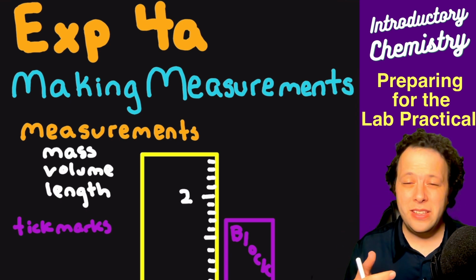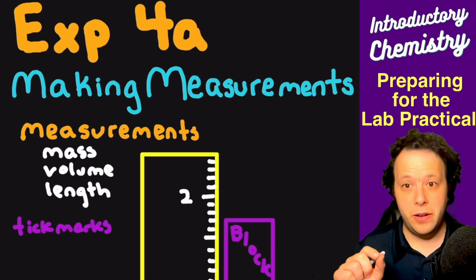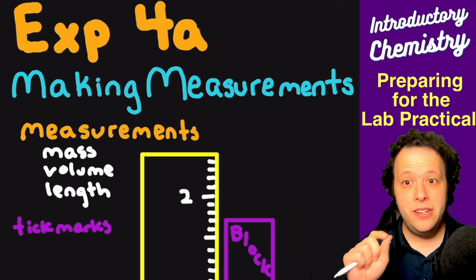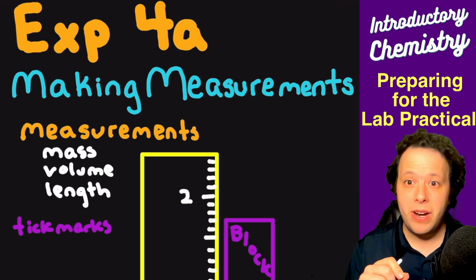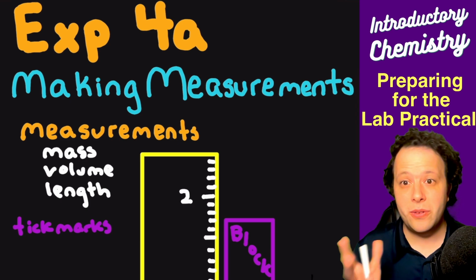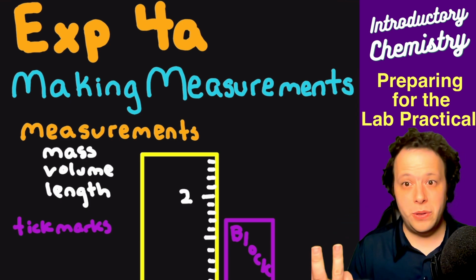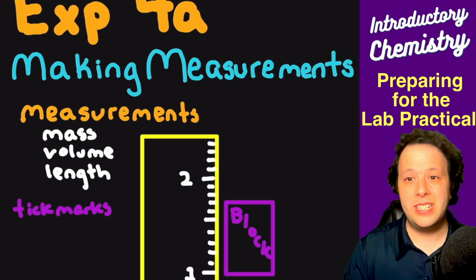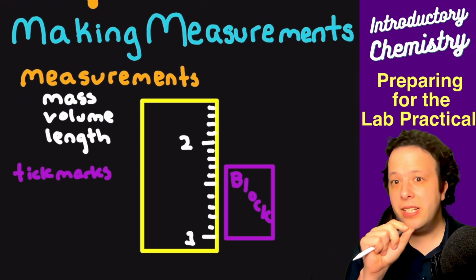When we're making those measurements, the biggest thing when you're taking your practical is that you need to record all of your significant figures and your units when you are writing down your answers. If you do not write one of those things, you might lose points on questions. You might have got the answer right, but you didn't write your units or show your work. So make sure you write all those things down. They're very important. When you're writing anything down from the balance, include all the digits.